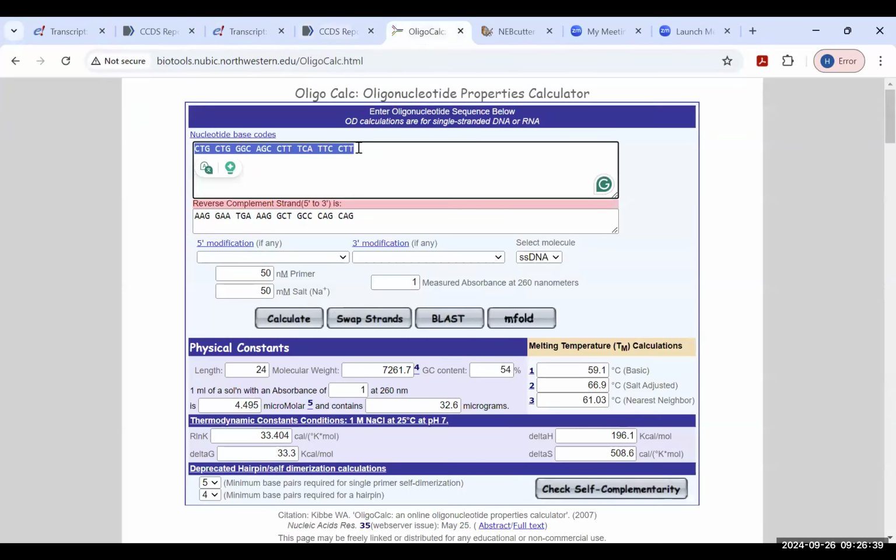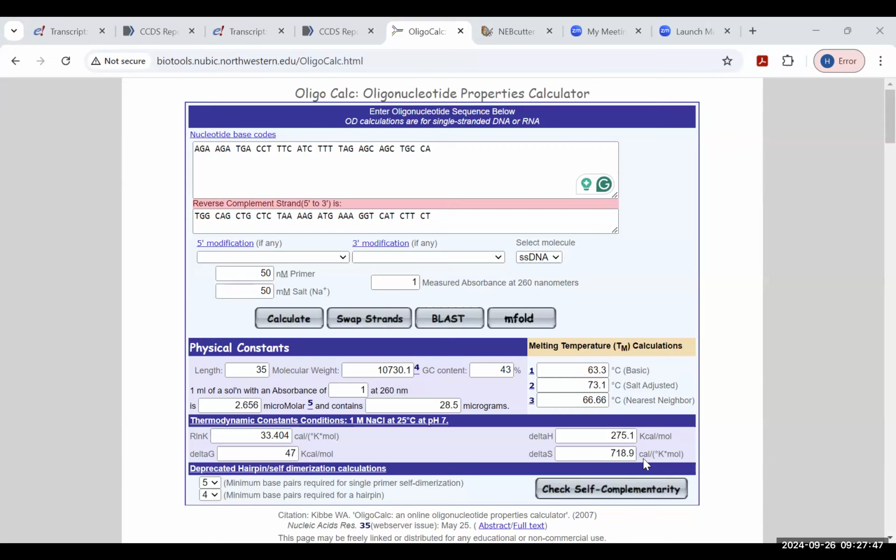primer itself, you can see that you have the CCTT, and then this A here is gonna bind to anneal to the T, and then that G is gonna anneal to the C, and then that T is gonna anneal to the A, and the T on this side to the A, and the C to the G, and therefore the primer will bind to itself. So this is a hairpin within the primer. So most of the molecules will be doing this, and your PCR is not gonna work well.